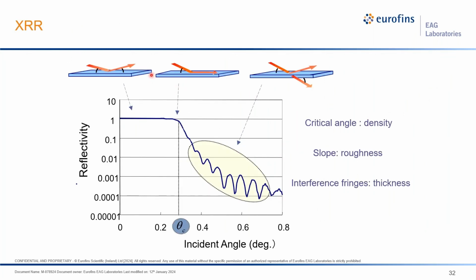So I also wanted to touch on XRR, which goes hand in hand with materials identification. When you do know the identity of the material, XRR is very powerful for thin films, which is another technique that, like Monica was talking about earlier about analyzing thin films, we can determine 3 things from XRR: density, roughness, and thickness of a thin film. And we can model usually out to 3 or even 4 layer models of films.